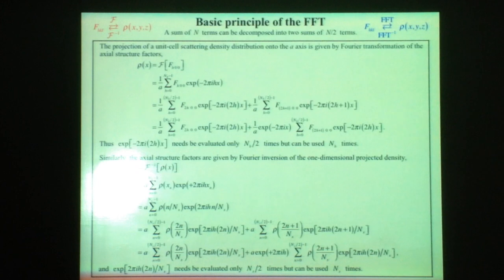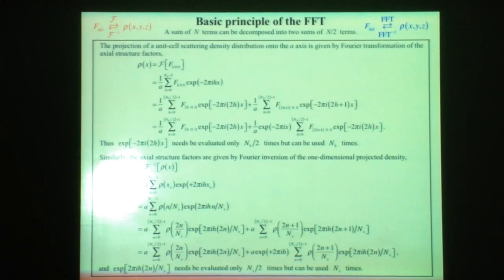And the other thing I mentioned on Friday is that there is this technique, method called fast Fourier transformation, which allows economies in computing time for computing either the density, as indicated up here at the top of this hard-to-read slide.